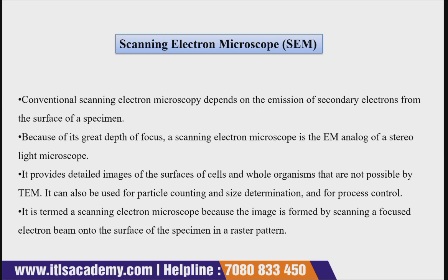It is termed a scanning electron microscope. Why? Because the image is formed by scanning the focused electron beam onto the surface of the specimen in a fast raster pattern. So that is the reason it is known as SEM.